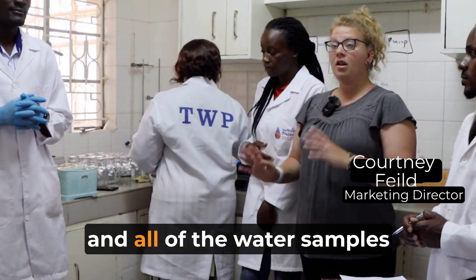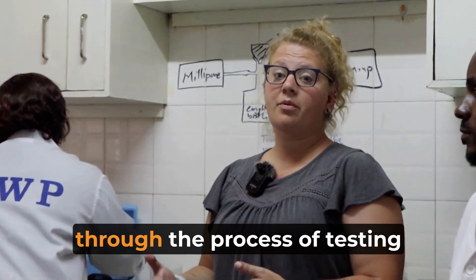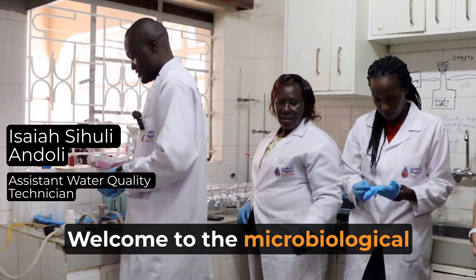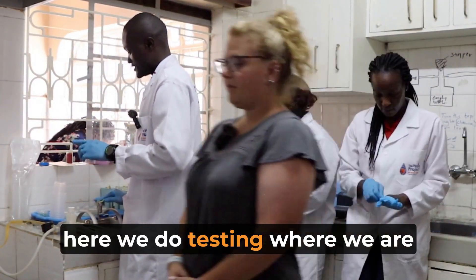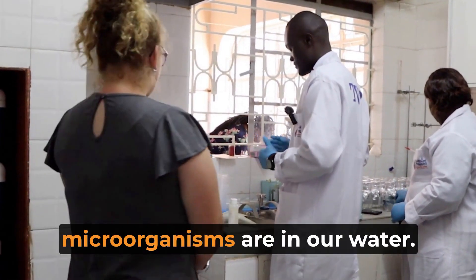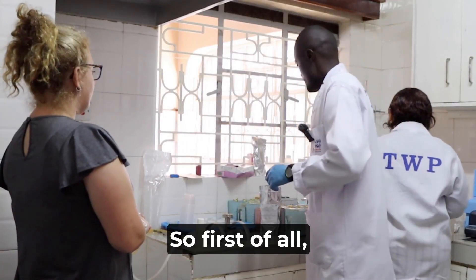We're back in the lab and all of the water samples have been turned in. We're going to take you through the process of testing that water. Now welcome to the microbiological department. Here we do testing where we are able to analyze the samples and find out what type of microorganisms are in our water.